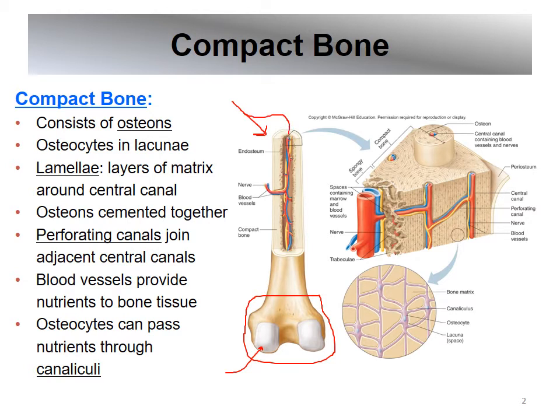So I've got this hollow middle cavity called the medullary cavity. Endosteum lining the spongy bone on the inside. There'd be yellow bone marrow in there, and so on. But what we've done with this, as you can kind of see, is they've taken a pie wedge slice of this and expanded it into this. So out in here would be the medullary cavity.